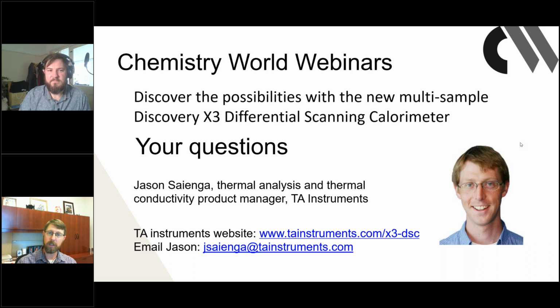There is also a direct heat capacity signal that you get with the 2500. The baseline reproducibility on the 2500 is slightly better than the X3. So direct heat capacity is making a single traditional ramp, 10 or 20 degrees C per minute, and being able to extract heat capacity as a signal rather than utilizing modulated. So there is that added benefit that still exists on the 2500 that doesn't exist on the X3.